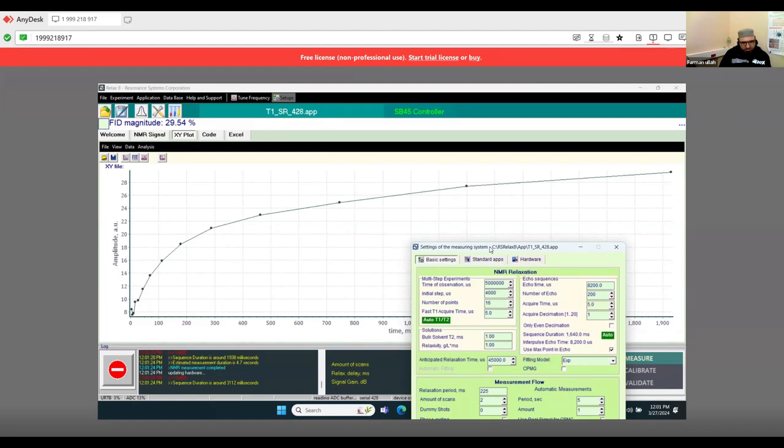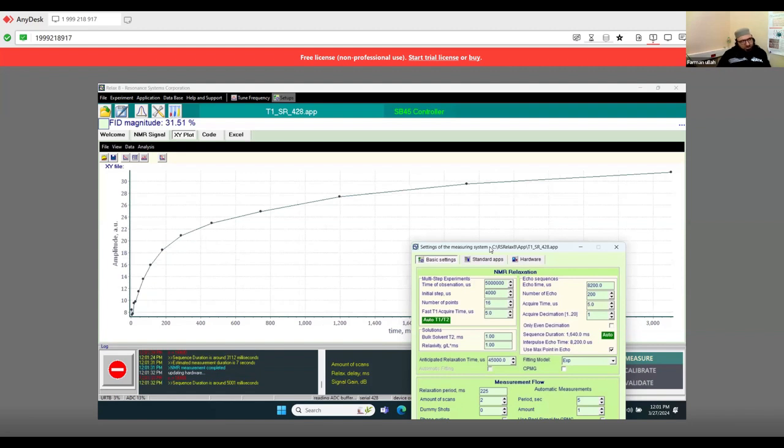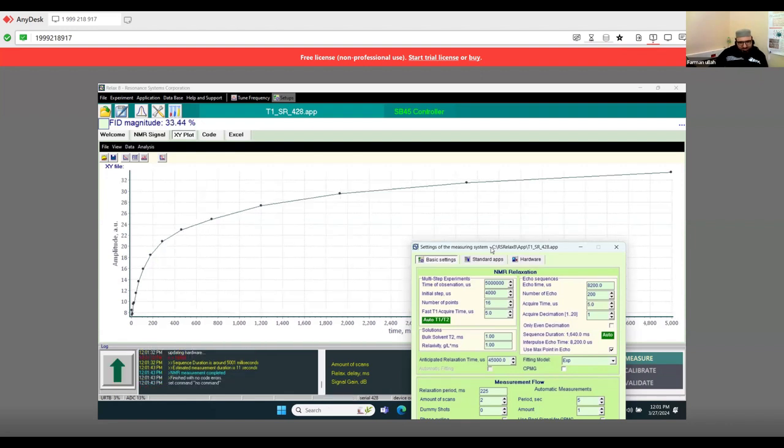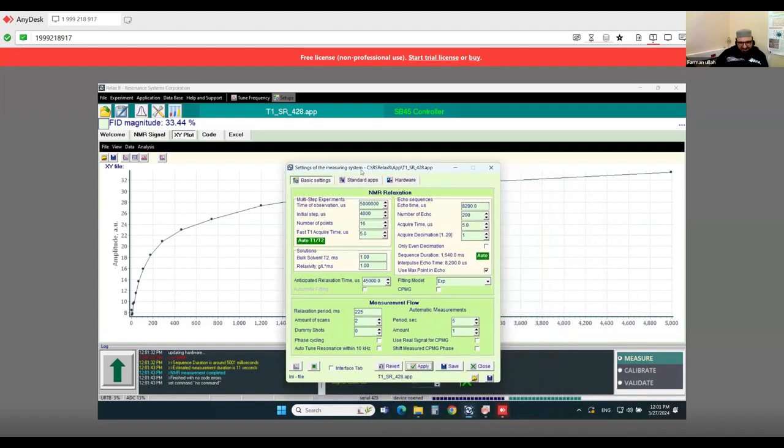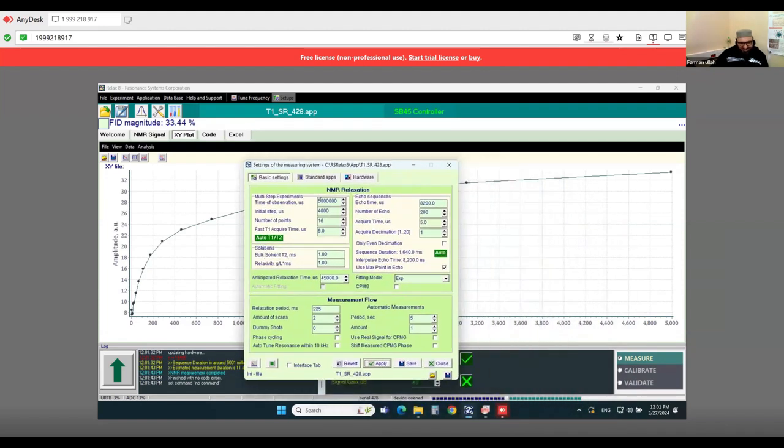To measure this chocolate sample, even though we worked very hard in FFC and changed different parameters, we are still fighting with these samples, because it seems again that it's not at equilibrium.